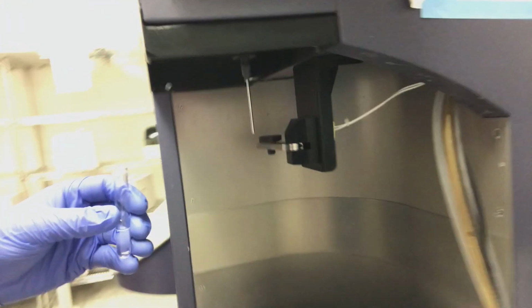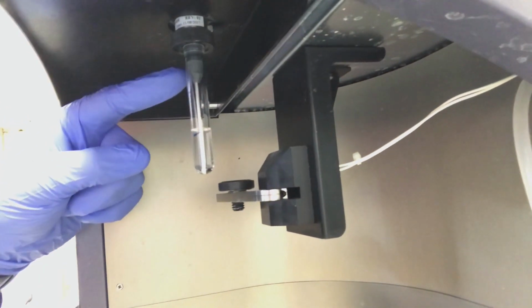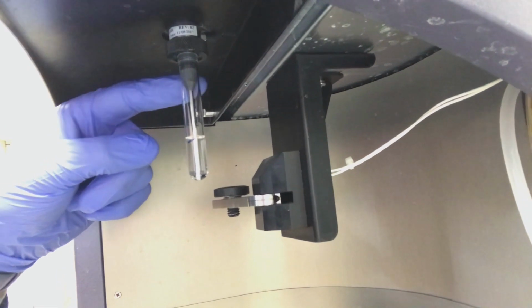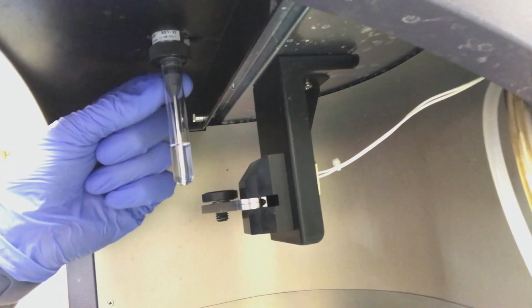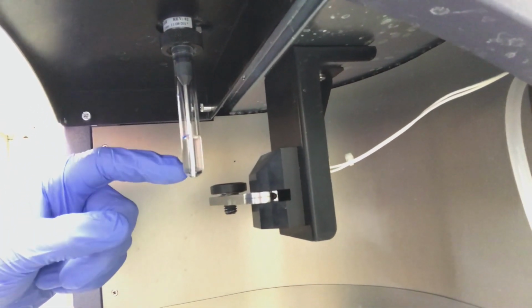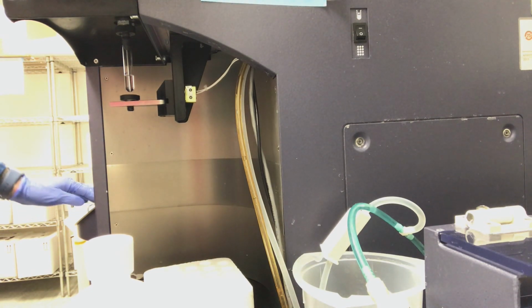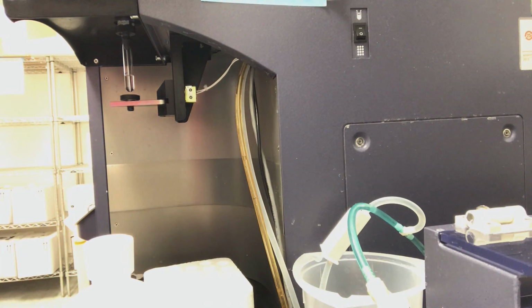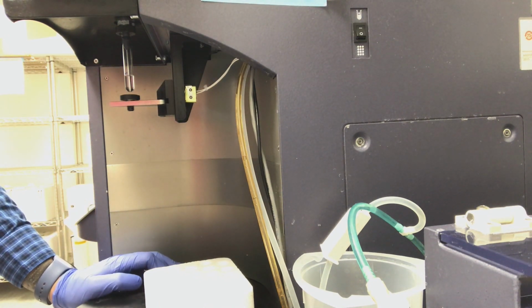It's very important that when your tube is loaded onto the machine, that the water does not come anywhere near this gray cone or the black rubber fitting at the top. The liquid should always be about halfway of the tube or below. Then you'll run and put the flow rate to high. Please run bleach and water for 5 minutes each.